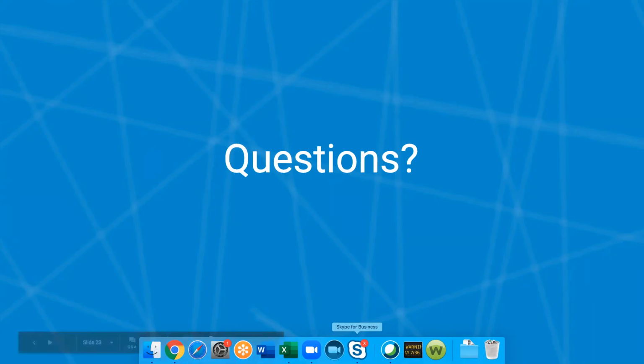We have another question on barcode support. And so that's something that we're currently investigating right now. We'd really like to get it into the product, particularly once we start to launch the freezer management feature as well, because we do understand that it's a really important feature for a lot of you. We're just trying to come up with the best way to actually help support people do their work with these barcodes. We found that a lot of the other sample management applications tend to have fiddly UIs with that, and so we're looking actually at integration options potentially with Bartender at this point.